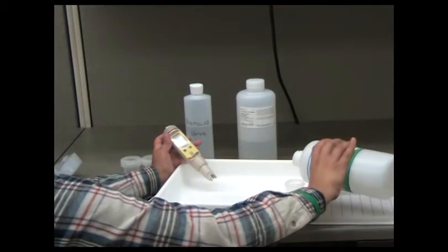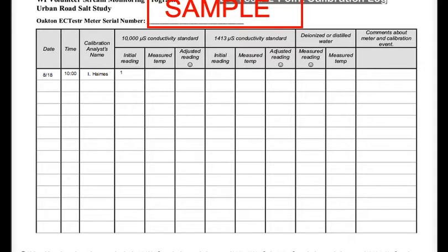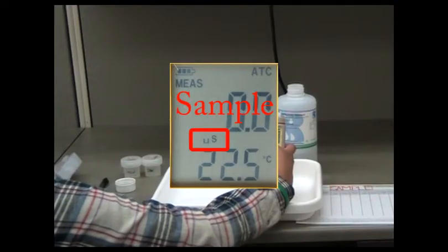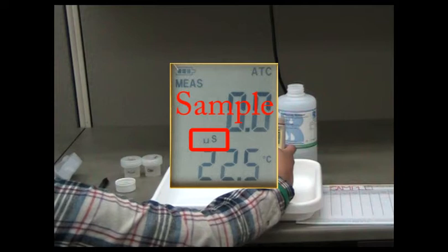Allow the reading on the meter to stabilize. Record the measured specific conductance reading under initial reading on the calibration log. Make sure to include the units, which can be found below the conductance reading and above the temperature.